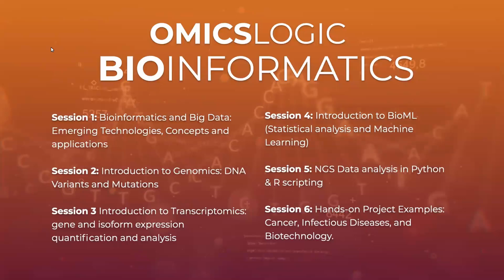So today we will talk about introduction to statistical analysis and machine learning. We'll take the gene expression table that we already prepared last time, kind of review what we did, and then try to analyze that data to understand what's in it and what does it mean.